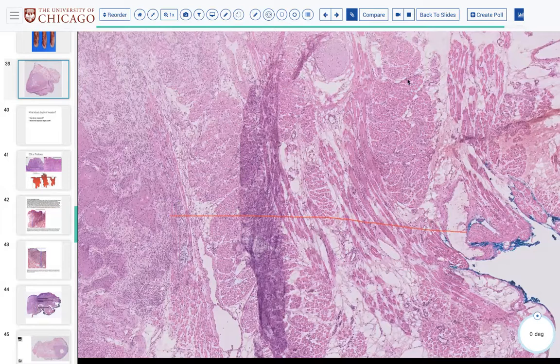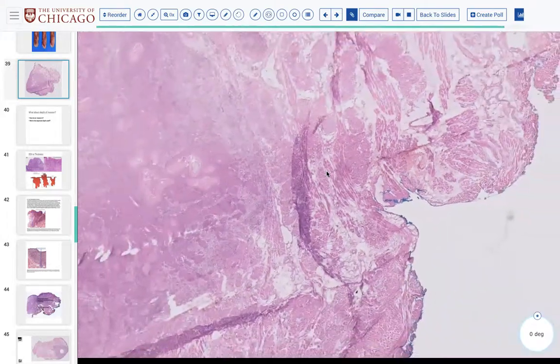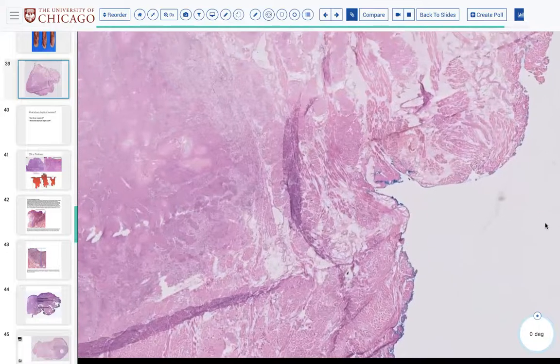Does this even have measuring? I like using the microscope objectives to measure distance, because they all have a standard diameter. And so you can gauge based on the diameter of your objective how far something is. Certainly you could use dots and a ruler. But I think you guys are pretty much okay with using those objectives to get that distance.